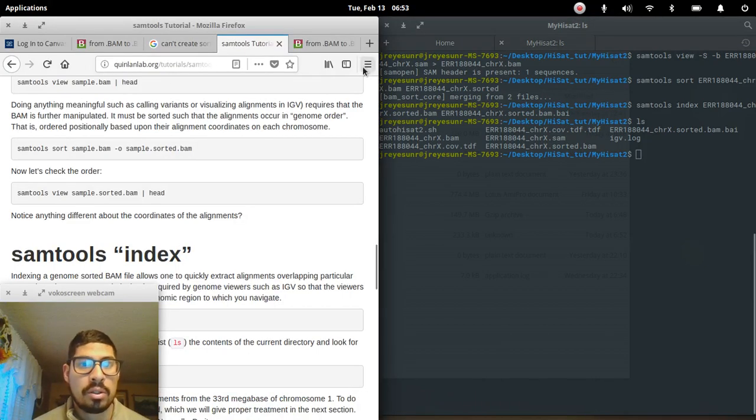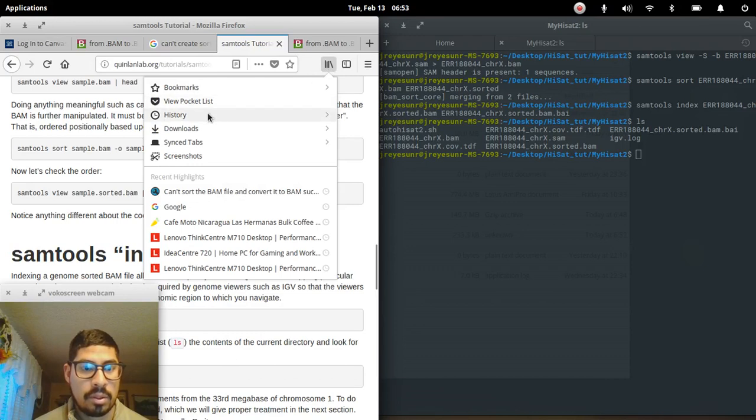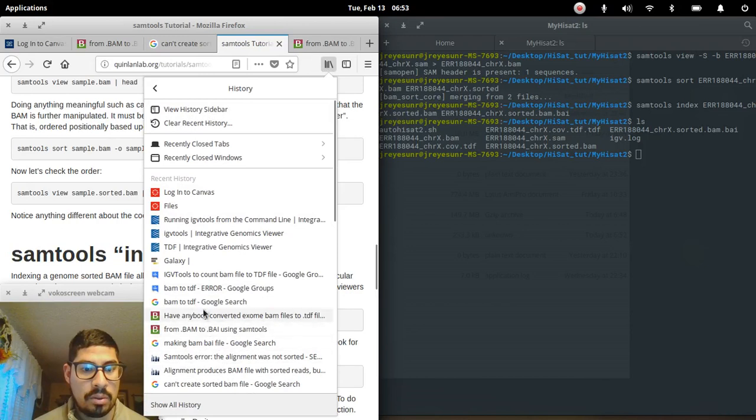Let's see if I have it. History or something. Tools. Yes. So it's actually under their website on how to use it.